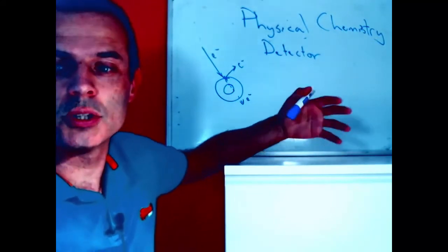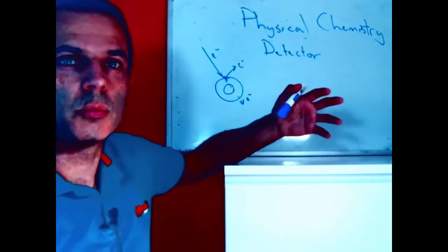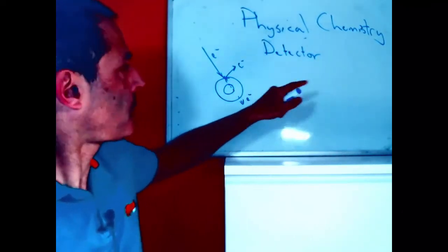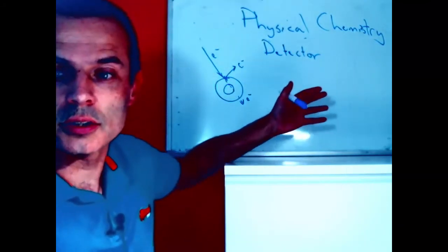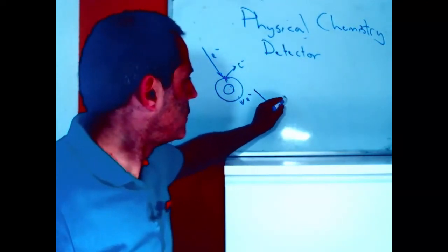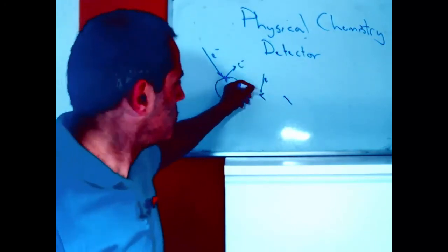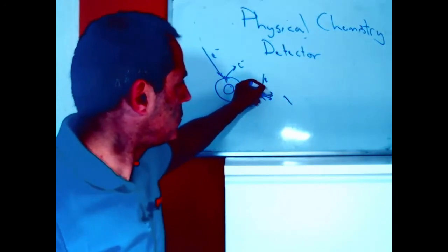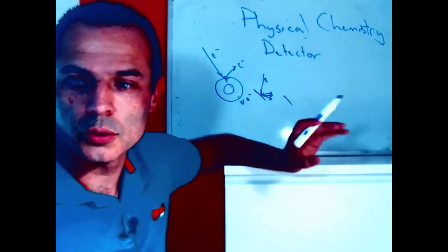In our detector, we're just trying to get more signal because we will have a small number of electrons and we need to count a lot of electrons to give us a current. So we need to multiply them up. We do that as I drew before, with a set of plates where the electron hits, more electrons come off, and the original one, and they're attracted to a second plate which is also the same.